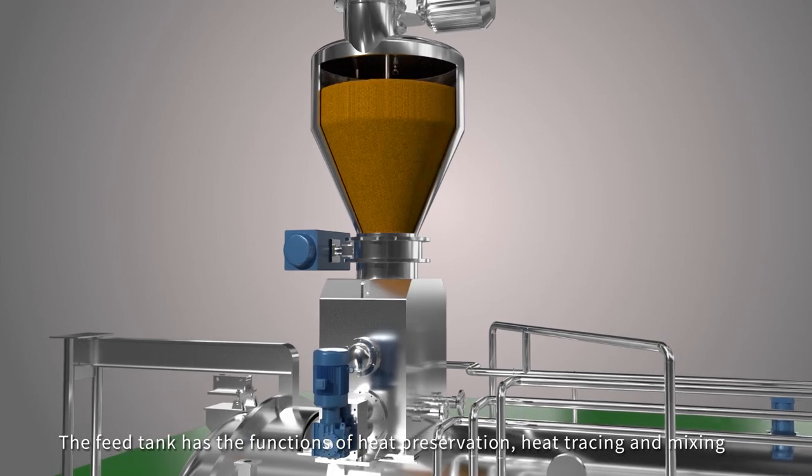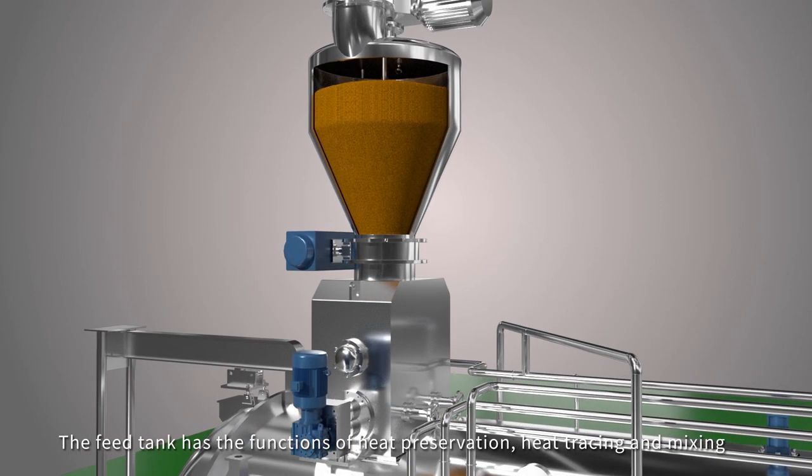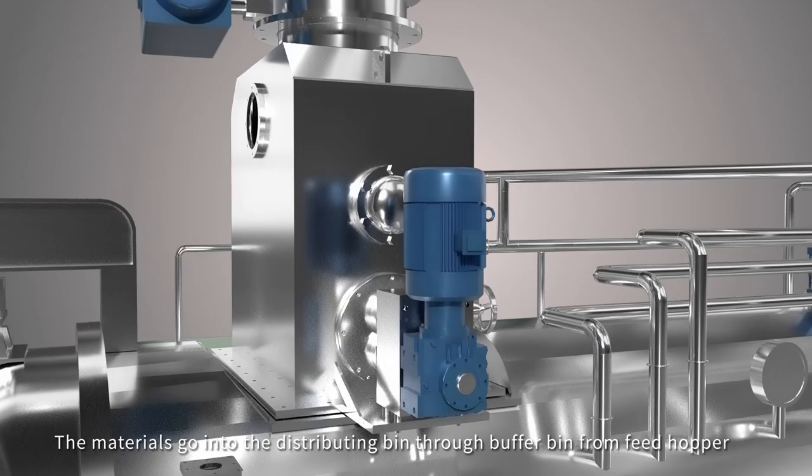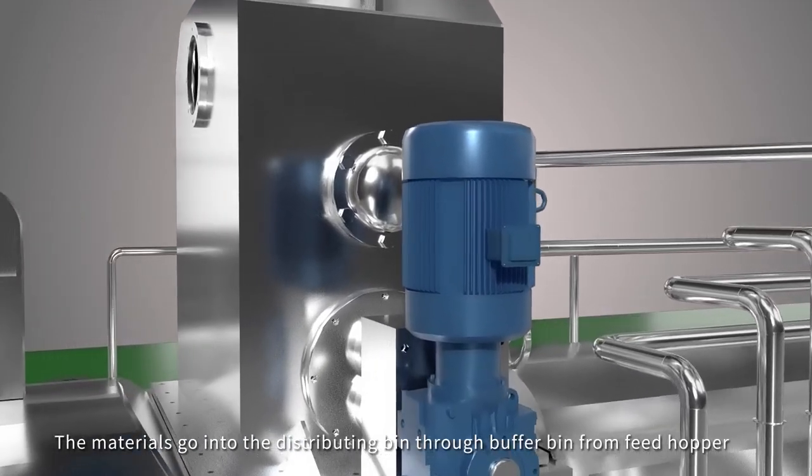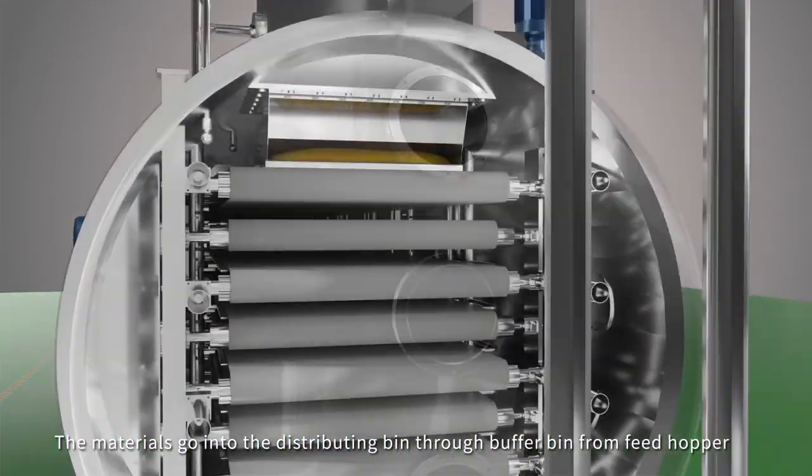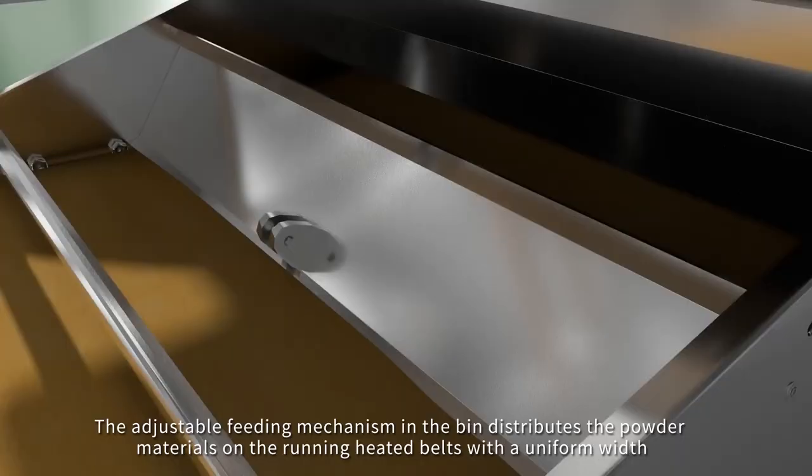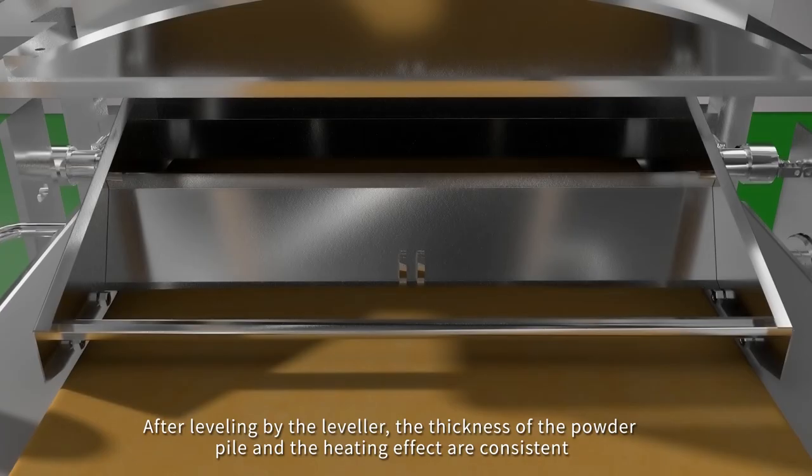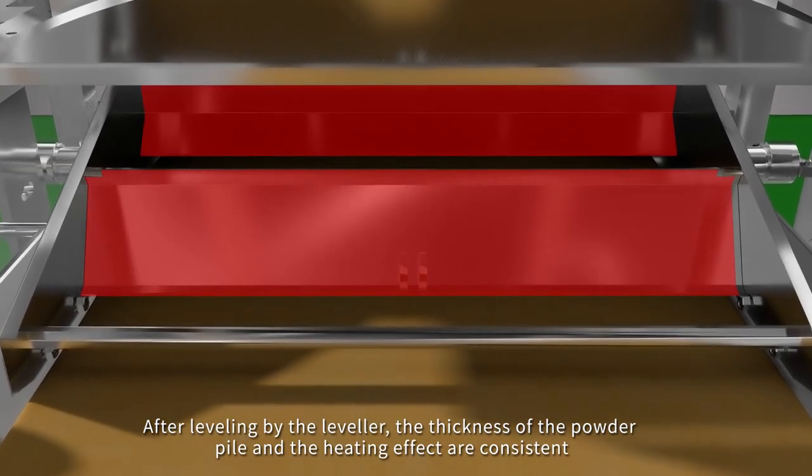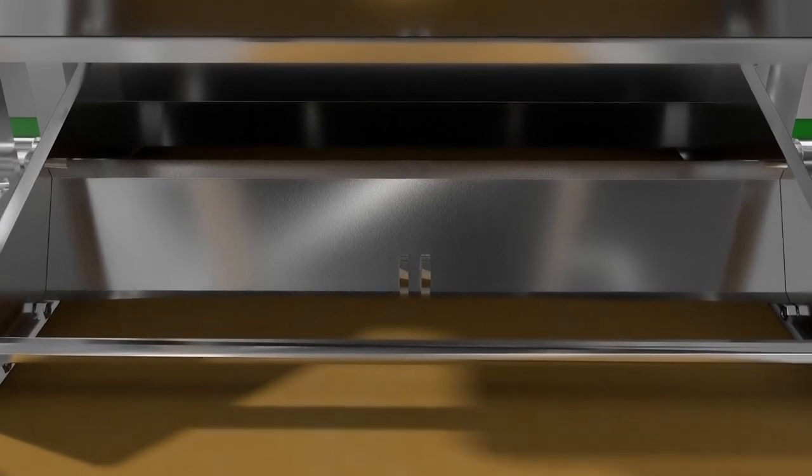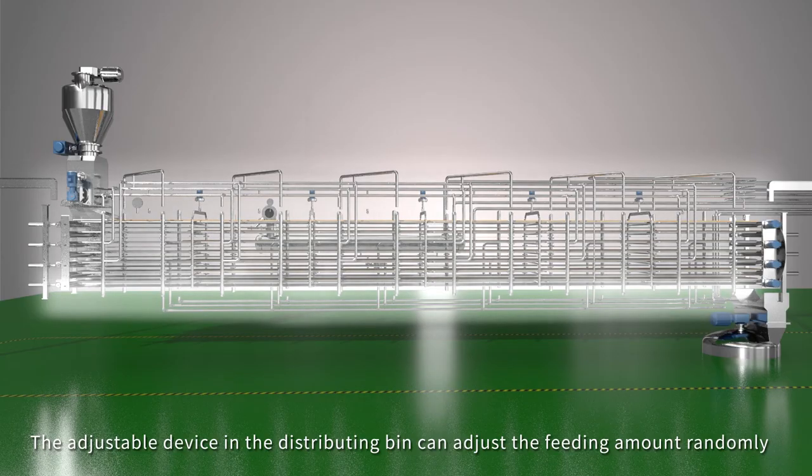The feed tank has the functions of heat preservation, heat tracing, and mixing. The materials go into the distributing bin through buffer bin from feed hopper. The adjustable feeding mechanism in the bin distributes the powder materials on the running heated belts with a uniform width. After leveling by the leveler, the thickness of the powder pile and the heating effect are constant. The adjustable device in the distributing bin can adjust the feeding amount randomly.